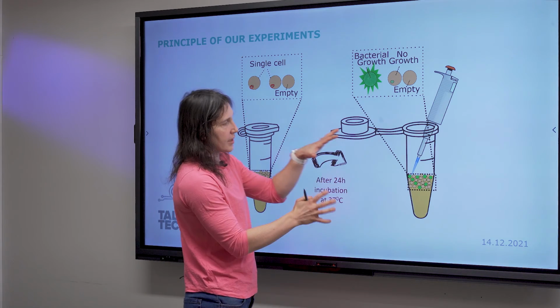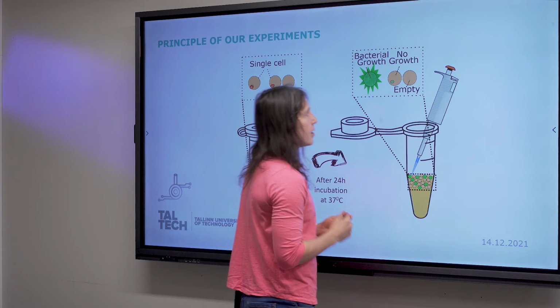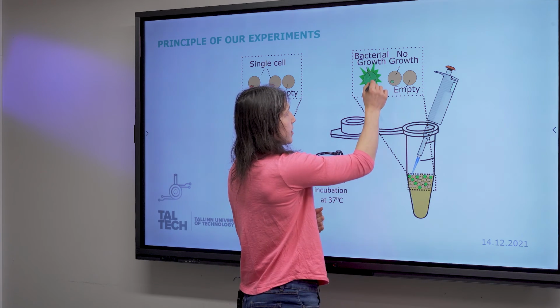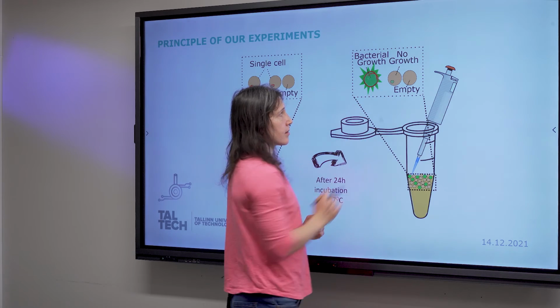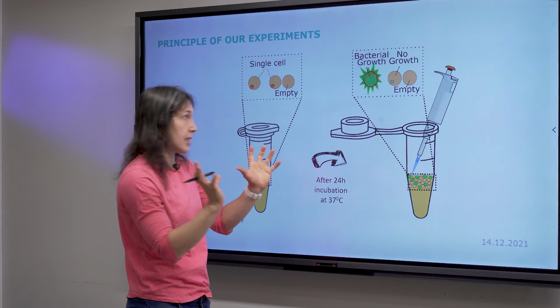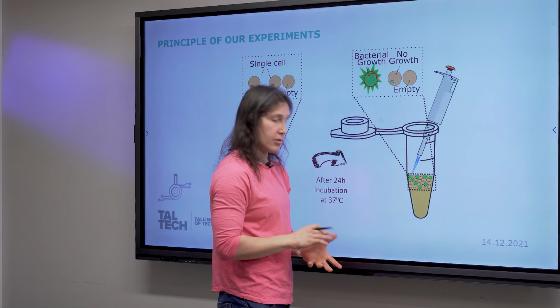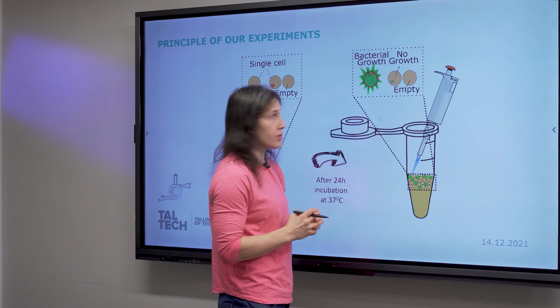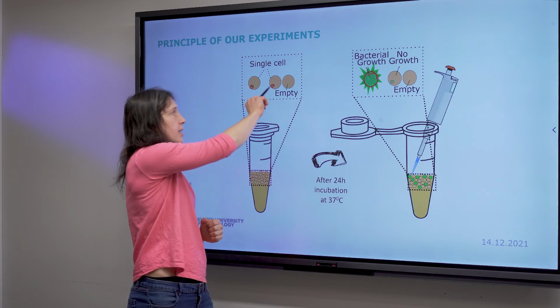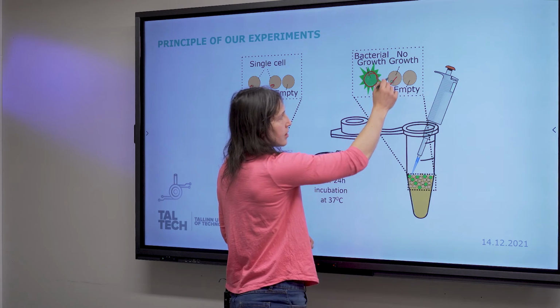And after incubation, if our bacteria are well and growing, if they have multiplied, then we see this nice fluorescent signal. If we have added a certain antibiotic concentration to this, then some that contained a bacteria in the beginning are actually dead.